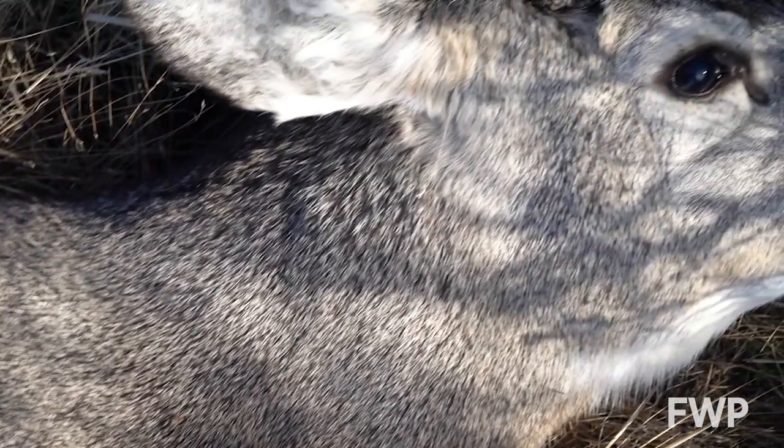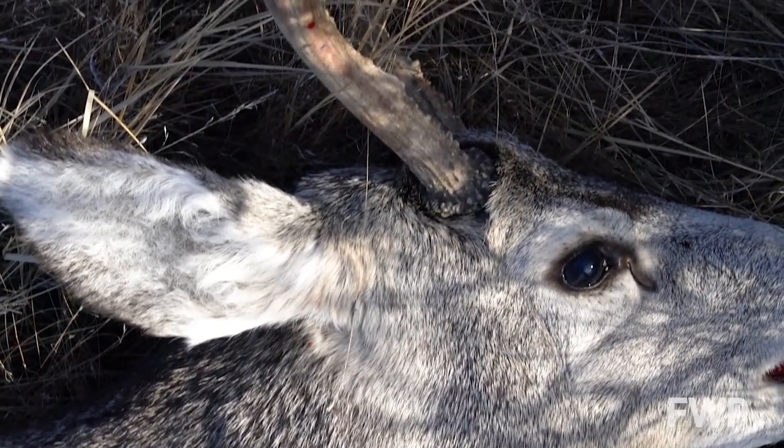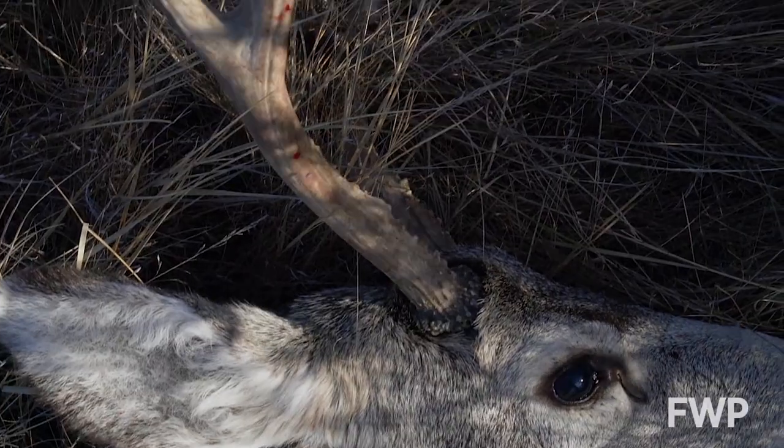Lymph nodes are easiest to find in freshly killed animals because the tissue's texture and coloration will change with time. Extracting the lymph nodes before removing the head from the carcass will ensure they aren't inadvertently discarded.